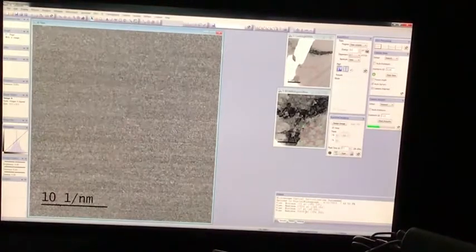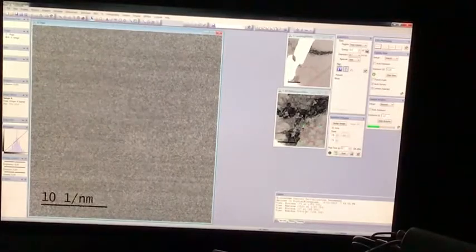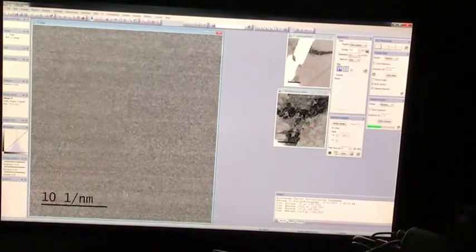That's good. That's not masking any of the other discs. Here we go. And I think that's alright. Analysis, statistics, minimum, maximum, 65,000. That's still too much. So if I go for an exposure time of 0.2 seconds, that should be alright.